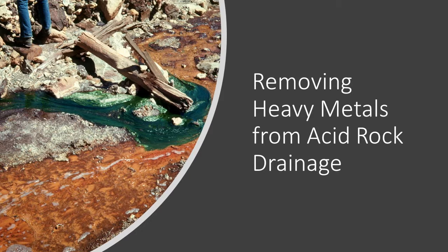The purpose of this video is to provide a laboratory skill test of one way to mitigate acid rock drainage impacts on the environment and humans through treatment. By providing a method for mines to treat the acid rock drainage at the site, we can eliminate the need for transporting the waste as well as reducing exposure to the hazards.